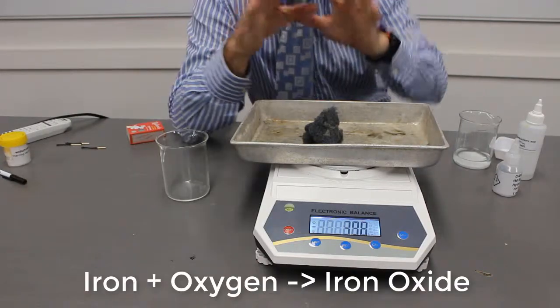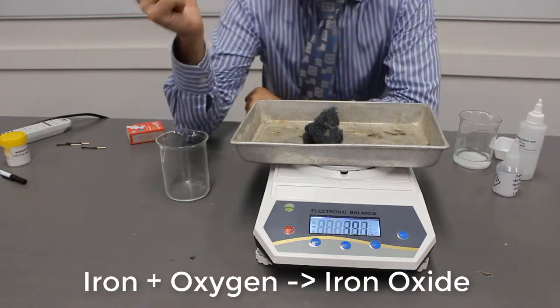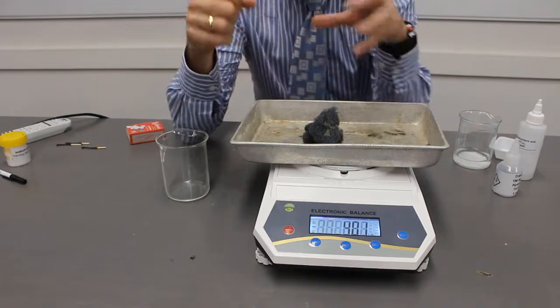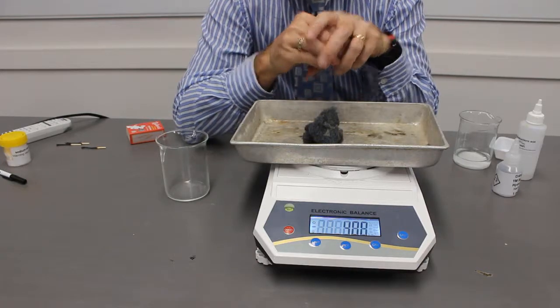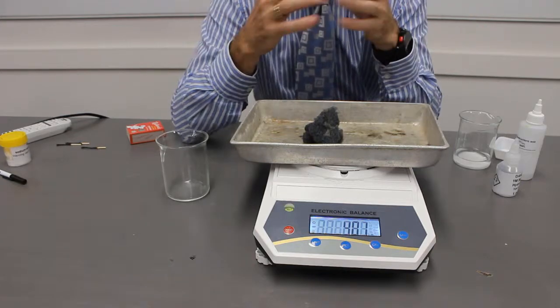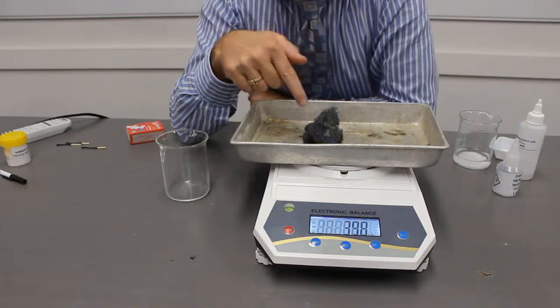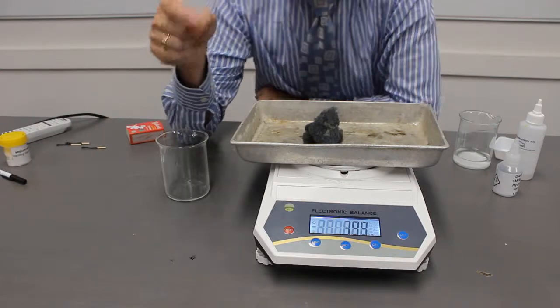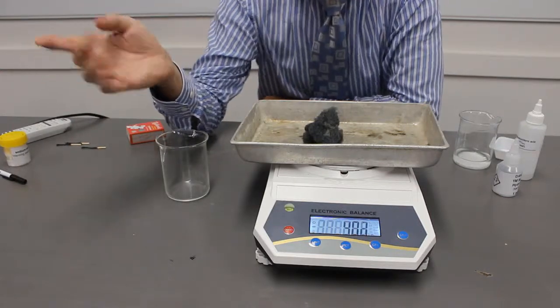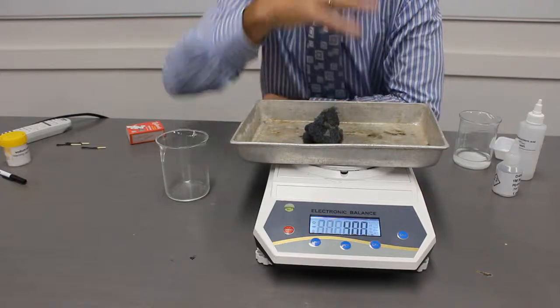Where did this oxygen come from? Well, it came from the air around us. Oxygen atoms have come out of the air and bound to the iron. That's why the mass has increased. Again, it complies with the law of conservation of mass because we can explain why there's an increase in mass. We know where that mass has come from. And it's come from oxygen from all around us.